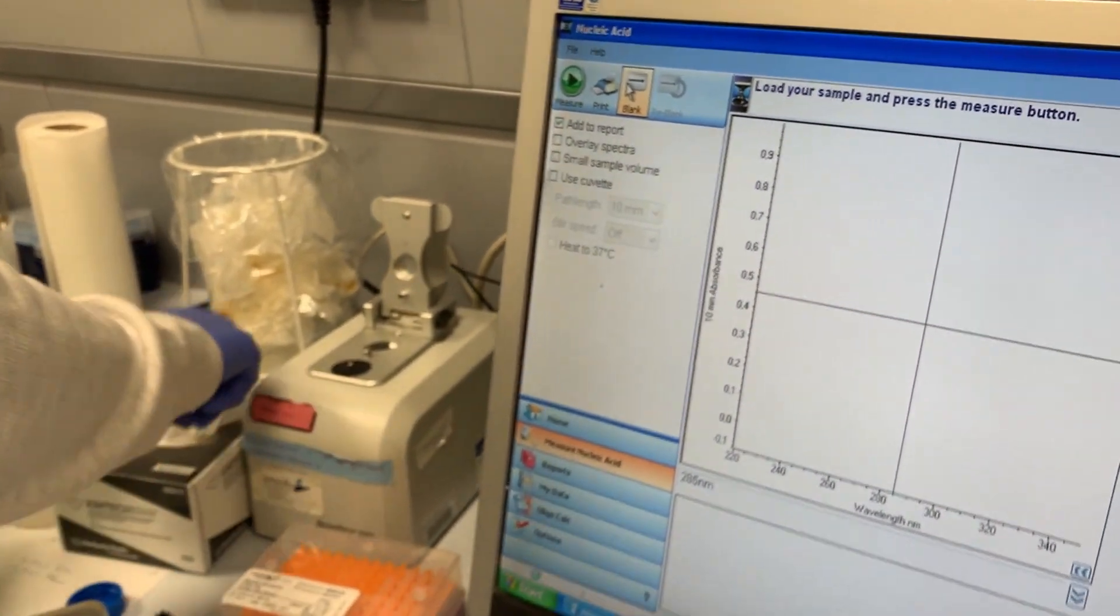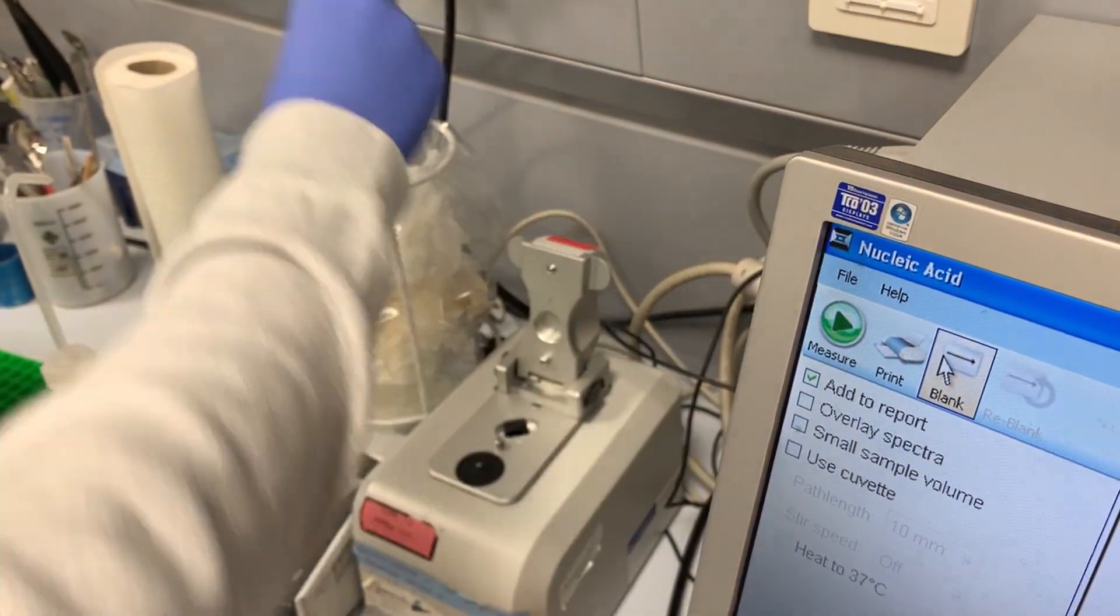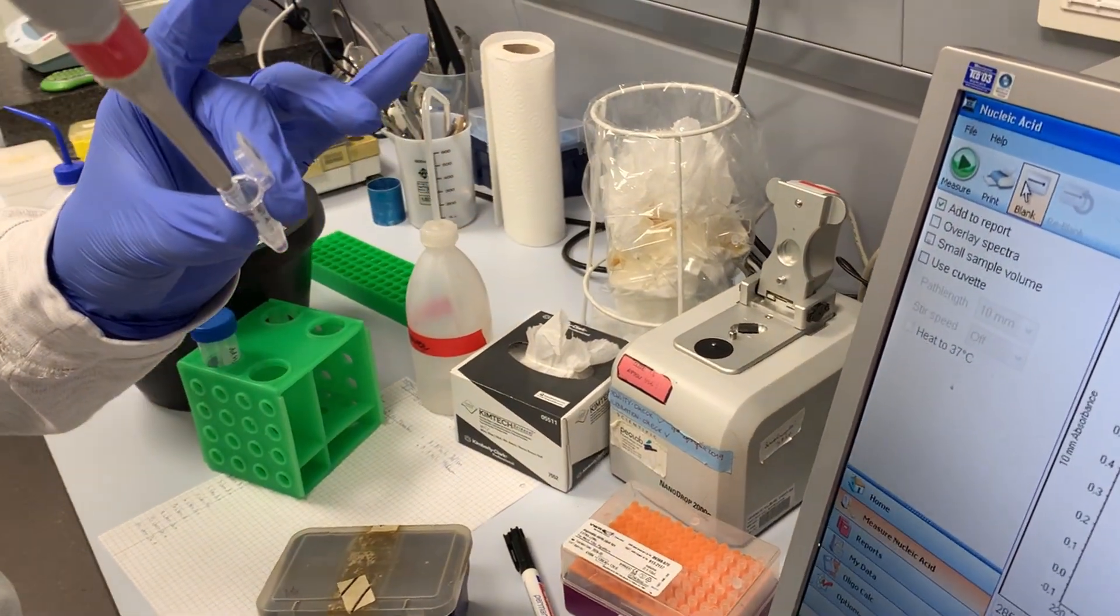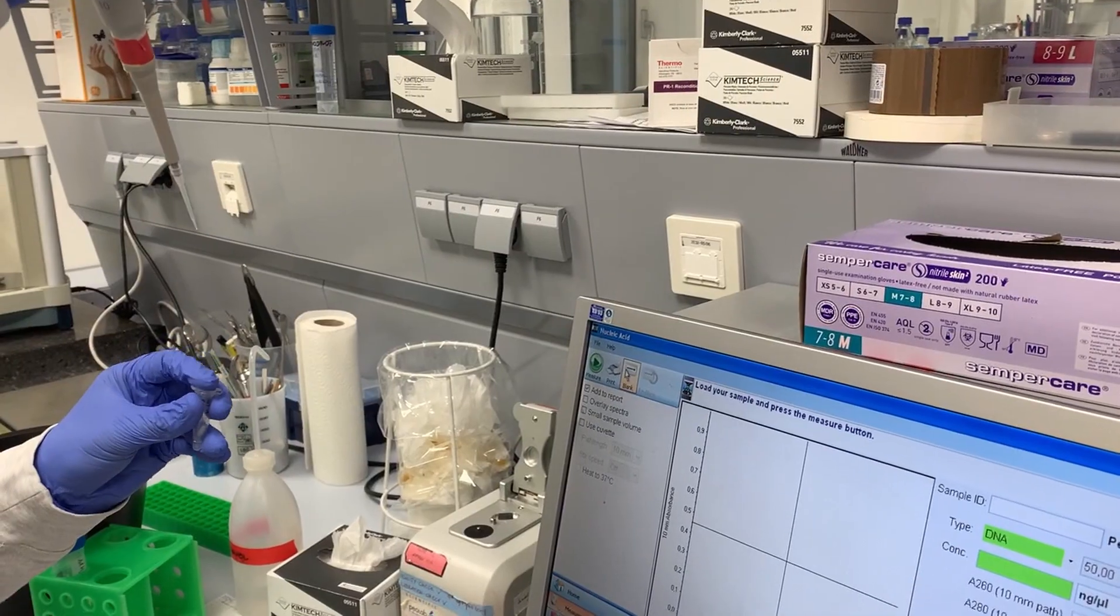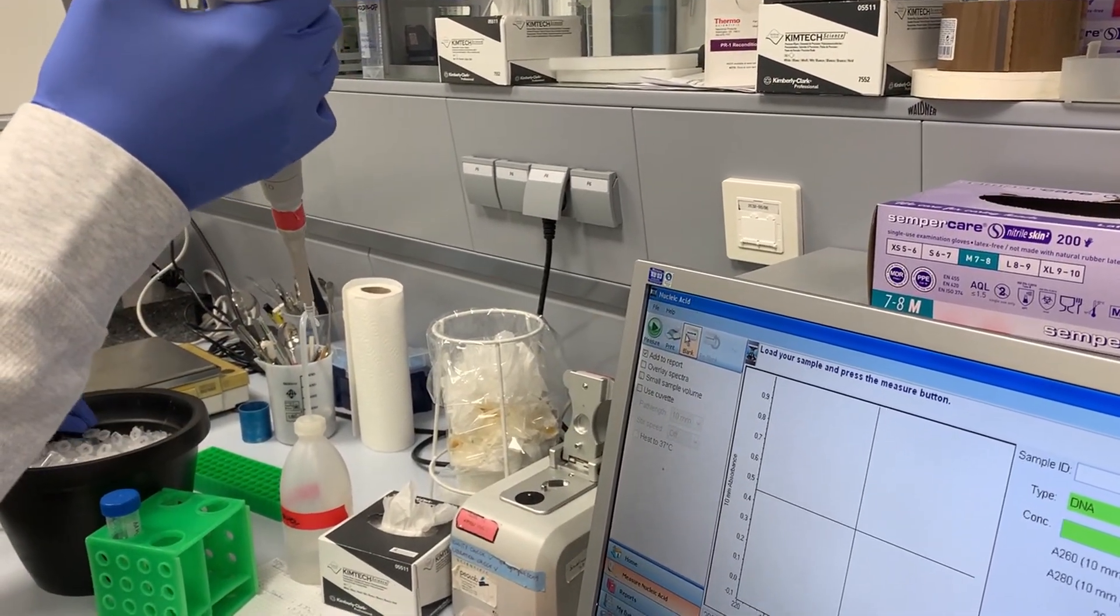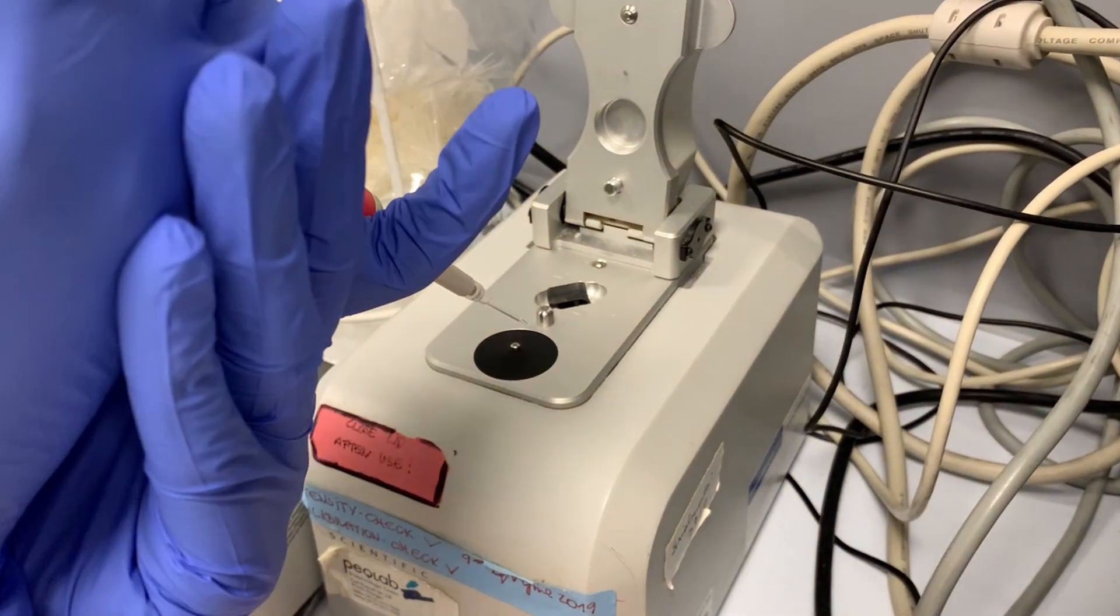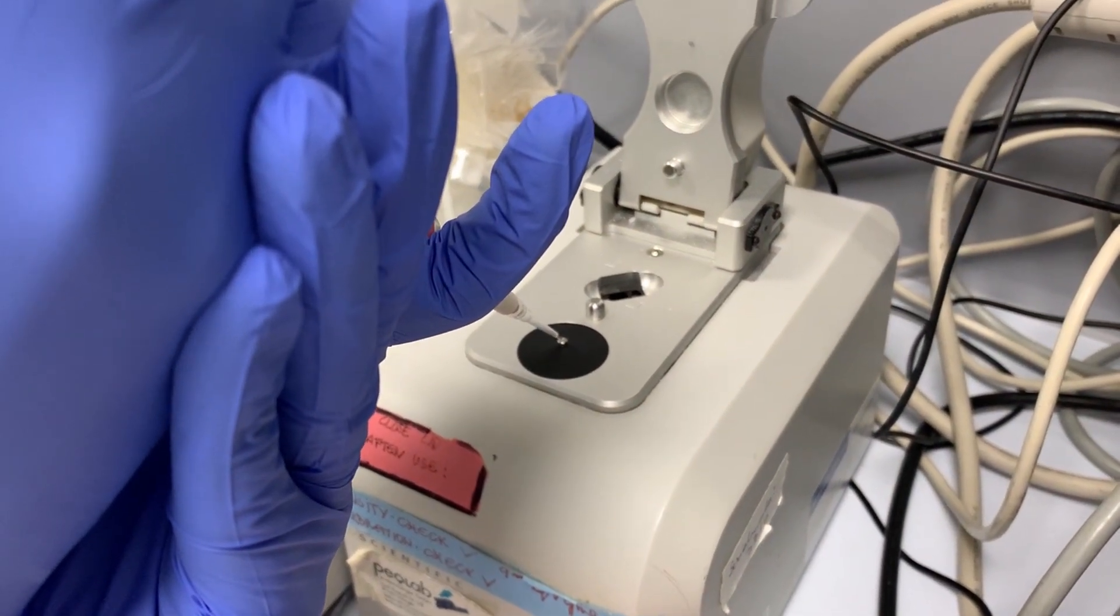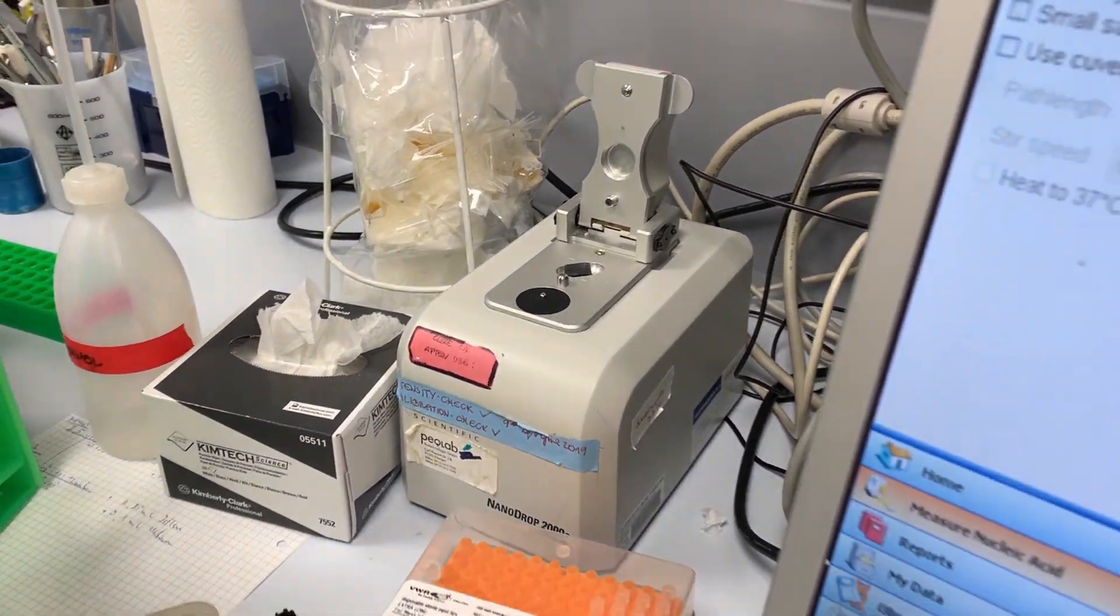Again, you have to clean the instrument. Then you repeat the same procedure. You use one microliter of your sample and again try to aim for the very center of the machine. And close the lid.